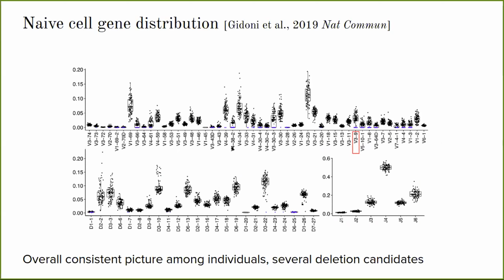Also, we can see it here in V438, where you can see a clear separation: one population is found at 0 and the other one is relatively high above it. Each dot here represents the relative gene usage of one individual. What we were mostly interested in is why we see this clear separation and what it represents.